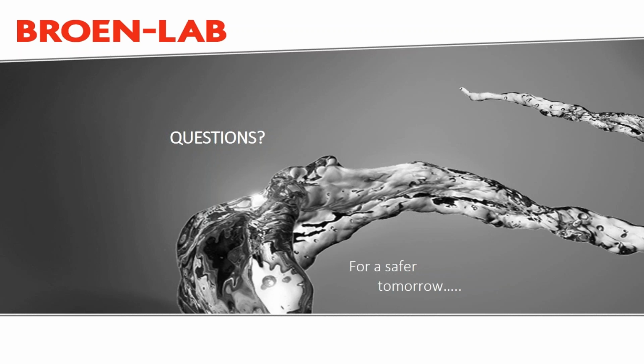Is it possible to say how long in feet or meters is 10 seconds from the accident to a shower? Do you have any experience regarding that? Yeah. It all depends on where you are, like if you're in front of a fume hood, where if there's a potential accident there might be escapement of gases or boiling water or whatever it might be. But typically you're going to locate it next to a door, which is probably a good 20 feet. I wouldn't say any greater than 20 feet from a potential accident-prone area.